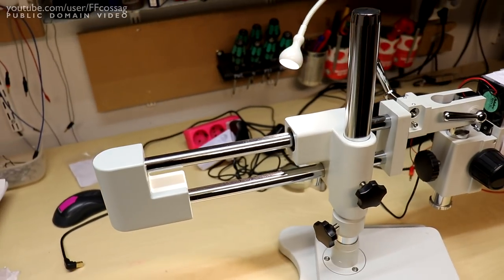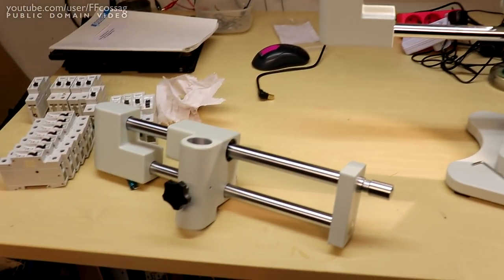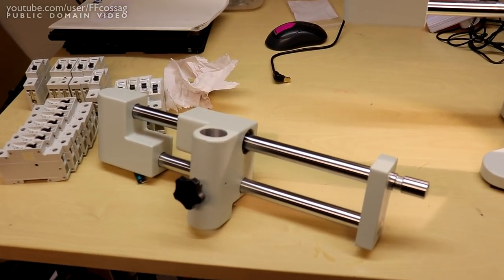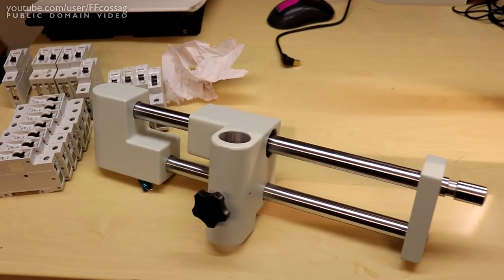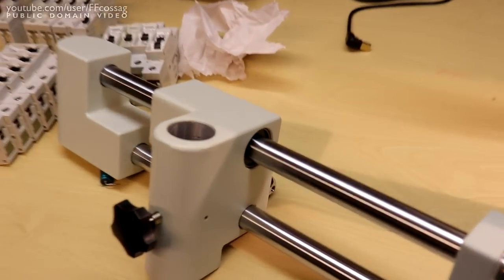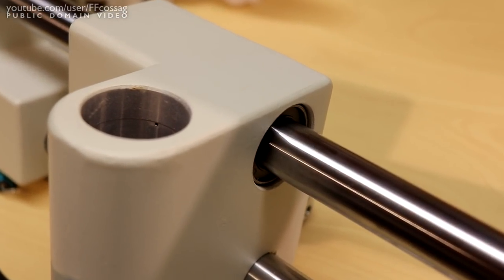So I contacted Amscope, they were very nice about it and they sent me a replacement arm. There's something interesting going on because I think this year, 2019, they finally figured out the issue. This boom arm does not look to be made of the same chrome soft metal as the other one.